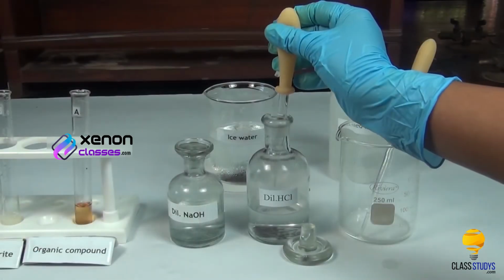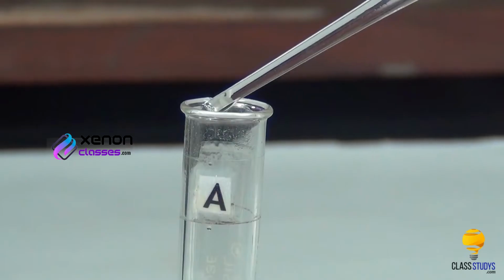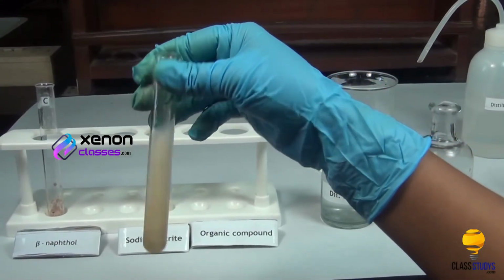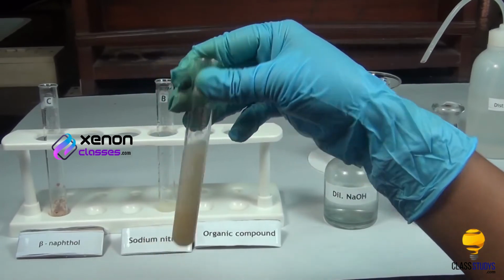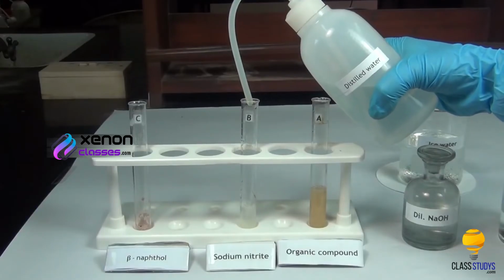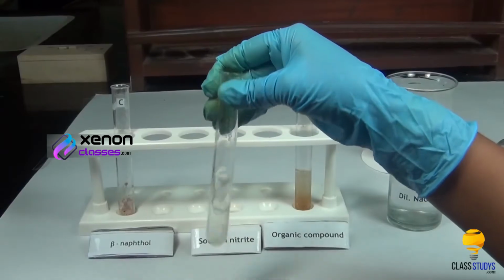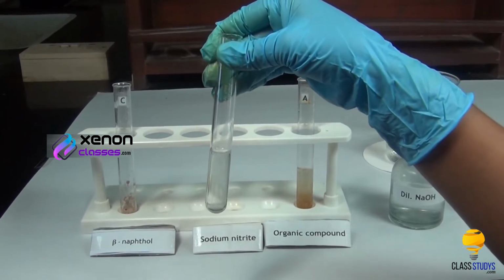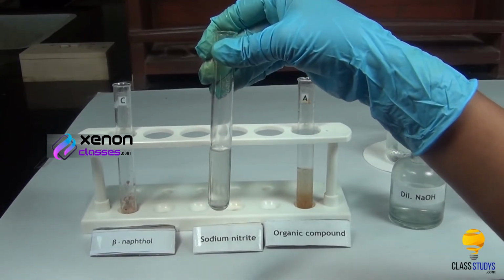Using a dropper, add a small quantity of dilute hydrochloric acid to test tube A. Shake the test tube well to dissolve the compound in hydrochloric acid. Now, add a small quantity of distilled water to test tube B. Shake the test tube well to dissolve sodium nitrite in distilled water to get sodium nitrite solution.